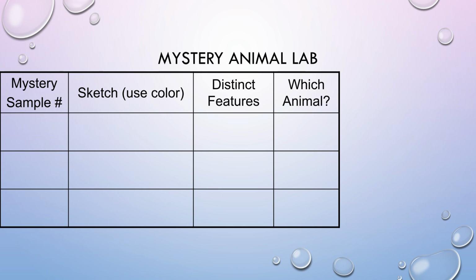Next, you will analyze mystery samples, recording your sketches and observations. Use your known samples to identify which animal each mystery hair sample belongs to.